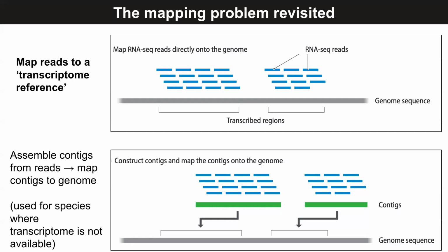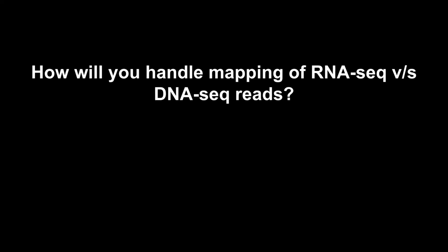You have these 3 different isoforms. Now I take a read. This is my R, this is my read. How do you decide which isoform it should be? Gene, it is okay. Gene, I know these are the boundaries. It should obviously belong to this gene. No issues there. Isoform R. So think for a bit, and let me move along, and I'll answer this question in a bit. The problem is clear.